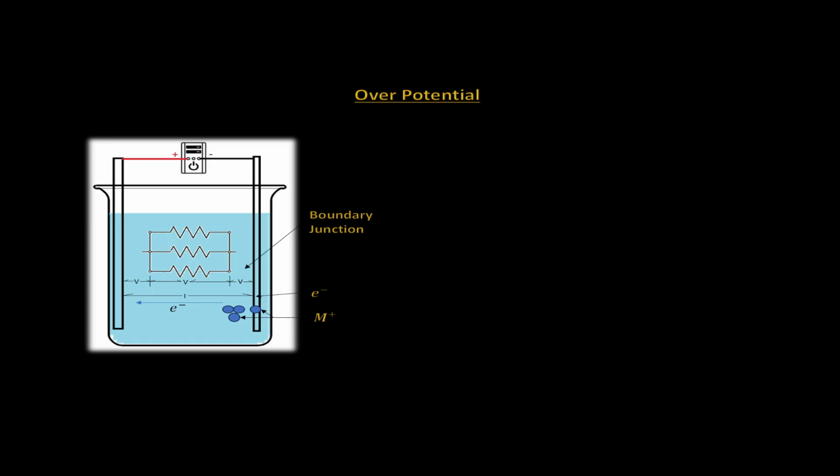As the ions become depleted, the resistance and current follow Ohm's law. To keep the minimum voltage required for total deposition without interference, the supply voltage will have to be adjusted. As the supply potential is initially set against the total resistance of the electrolyte containing the ions in solution, the drop in the ions dramatically increases the total resistance of the electrolyte.